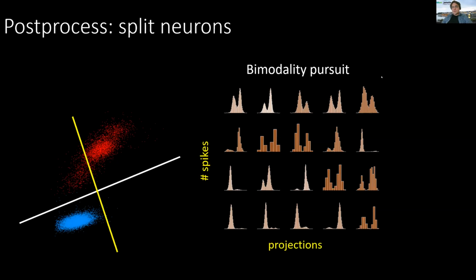Yeah, so just to anticipate a little bit, and then you can ask Anna. Basically, we have a setup where you take two sessions. We know pretty well how to align two sessions to each other. We spike sort them separately, and then we align them. We align the spike sorted results to each other, and that's the one that doesn't work actually. No, that's not what she does. I mean, she actually pretends it's all one day.